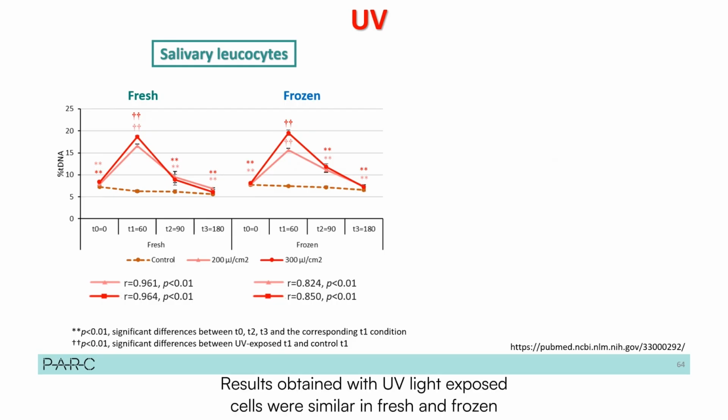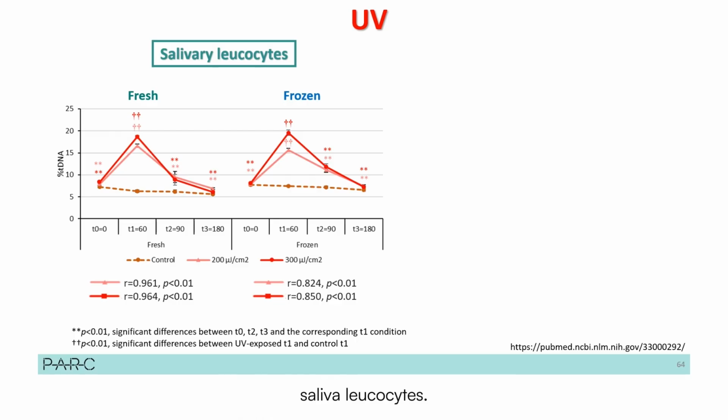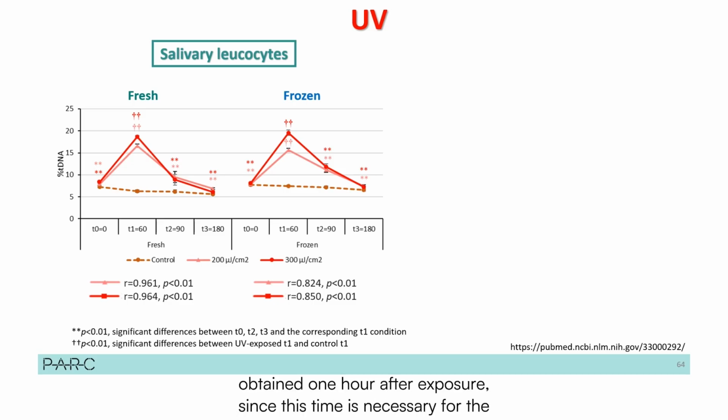Results obtained with UV light exposed cells were similar in fresh and frozen saliva leukocytes. In this case, and as expected according to previous studies, the maximum level of DNA damage was obtained 1 hour after exposure, since this time is necessary for the maximal expression of strand breaks after exposure, mainly due to the nucleotide excision repair process.